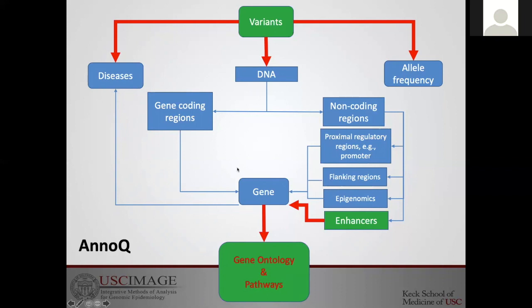The second is the functional data are integrated into the pipeline. And the third is the enhancer annotations can be easily accessed through this pipeline also. Overall, this becomes a one-stop shop.